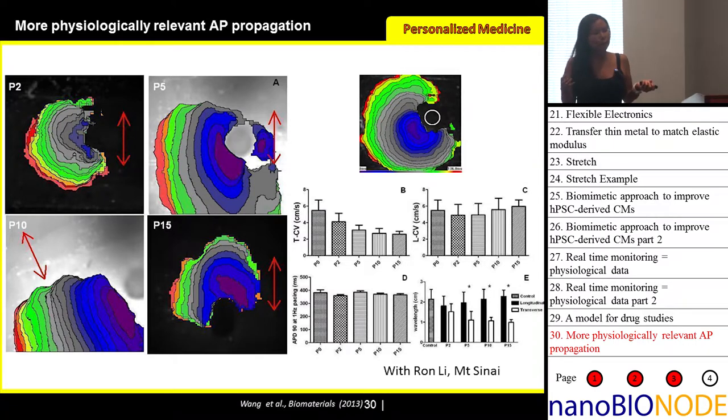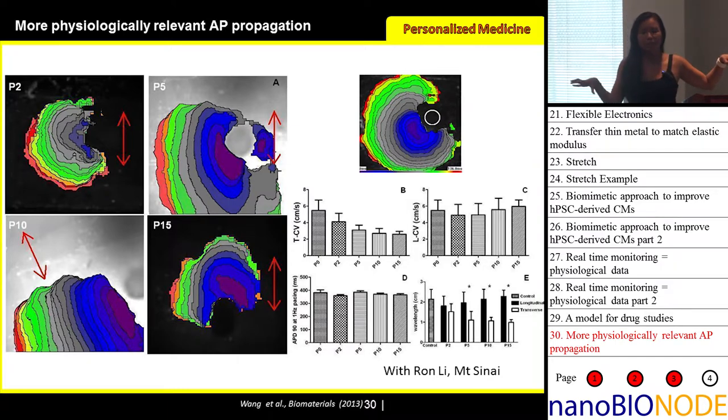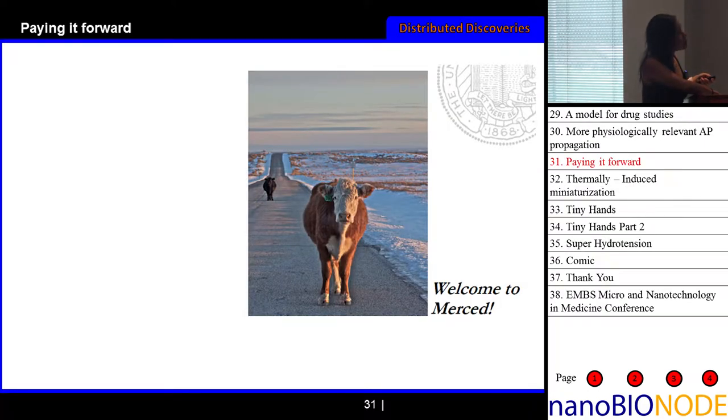And now we're incorporating some machine learning algorithms. So we're just running the optical flow. We're taking videos of these things, then we're feeding them into our machine learning algorithm, and we're picking out differences from the drugged versus the undrugged cells. And we're seeing that we can actually do as well as we have a GFP tagged reporter cell line. And we're showing so far that we have the equivalent sensitivity, if not even a little bit improved sensitivity, to the fluorescently tagged lines.